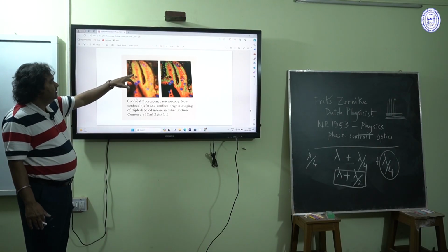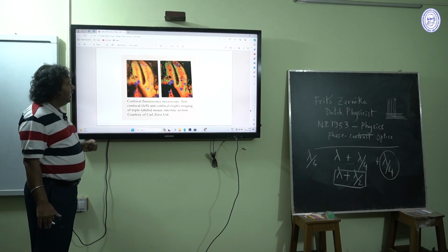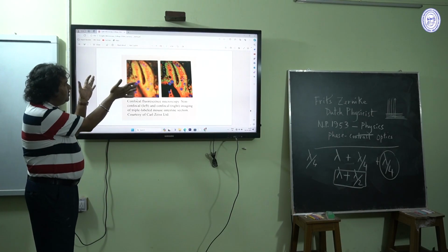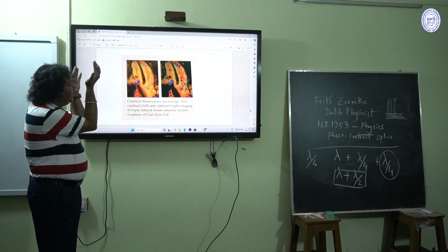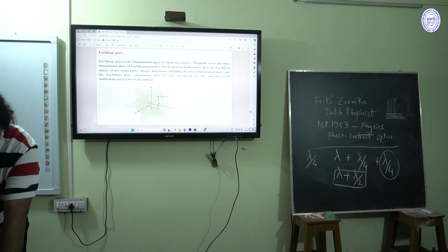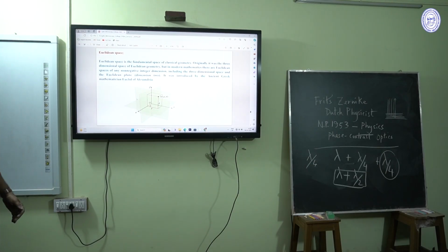The image is of much more inferior quality. And here, the image is taken with the help of a confocal microscope. Same specimen, but you can see the quality of the image with your eyes. You can clearly understand.